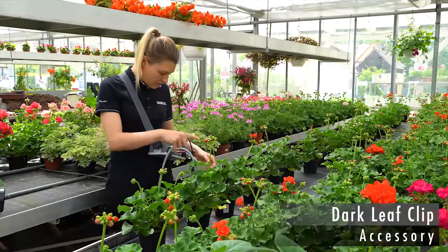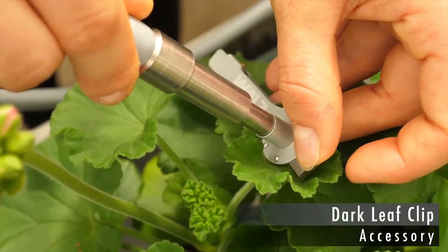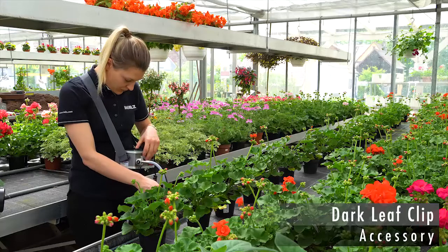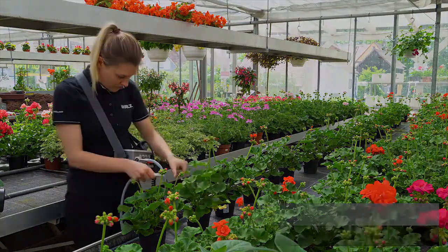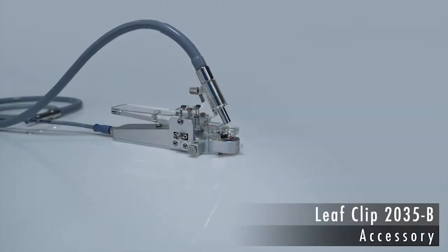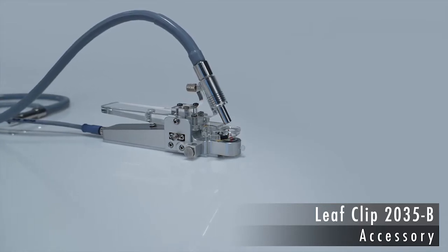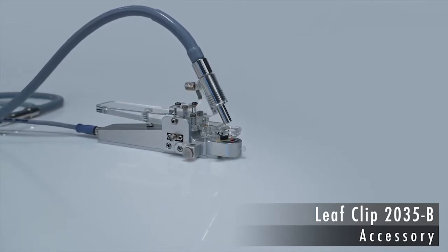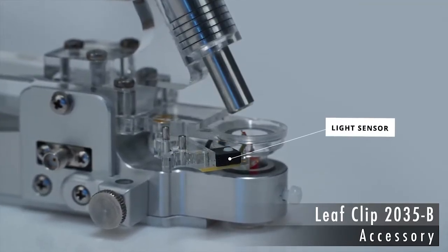Twenty minutes after placing the clips, Sabrina can probe the entire series of leaves in one run. The 2035-B leaf clip is designed to measure the performance of Photosystem II when the leaf is exposed to light. The leaf clip is equipped with a precise PAR sensor.